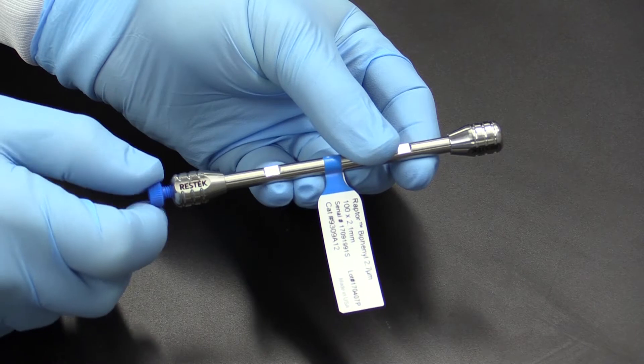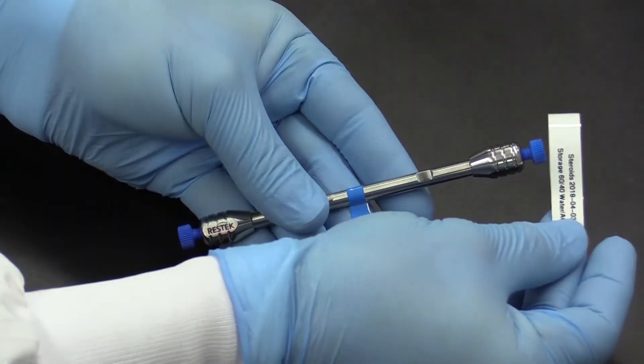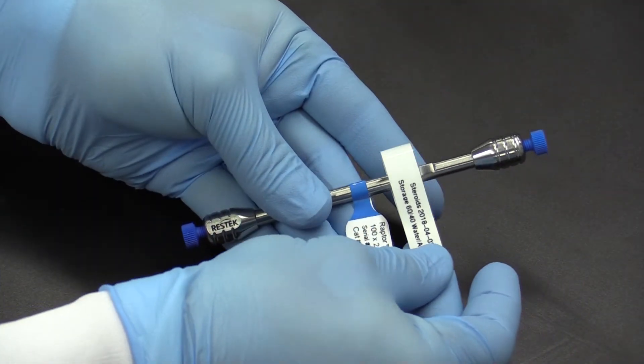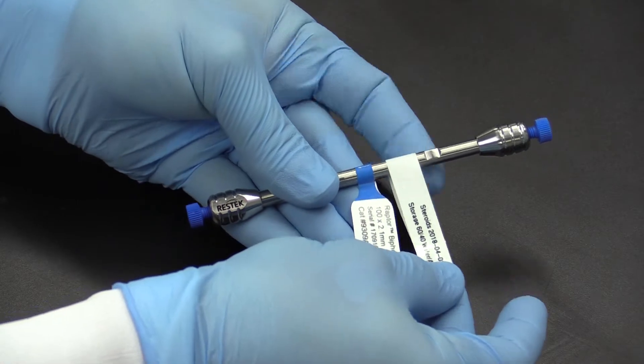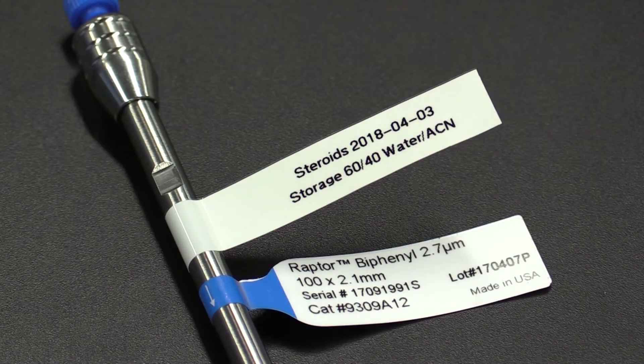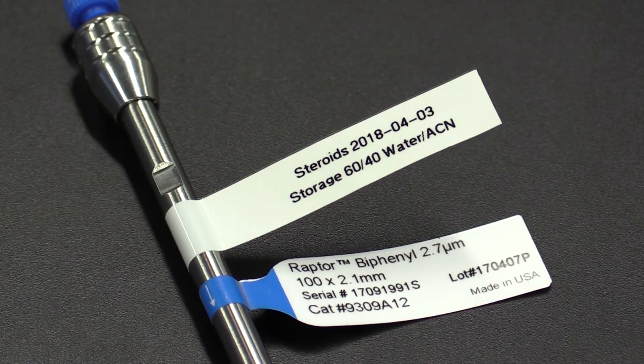And for either type of storage, make sure the column plugs are tight so it doesn't dry out. It's a good idea to label the column with the date and also the storage solvent so you know how to properly equilibrate it the next time you need to put it back to work.